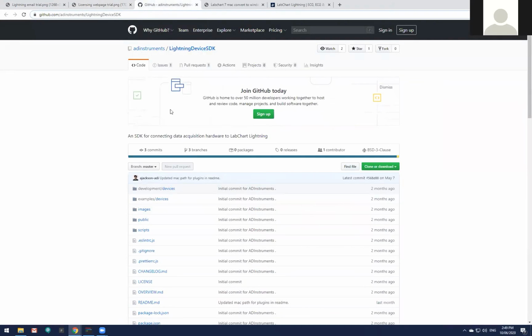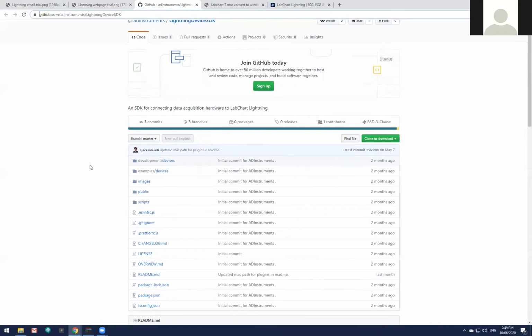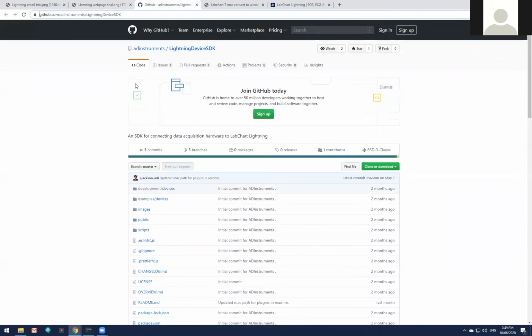Yeah, that's the SDK that I was referring to a bit earlier on. So I will show you this link later on if we're talking more about the serial devices. I'll send this to you as well. So that's done. So let's say you wanted to import some of your files. How are we going to do that?